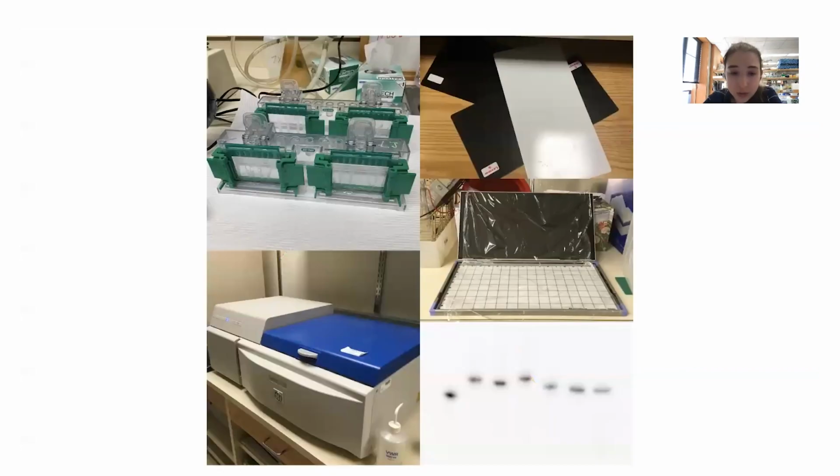And how we actually visualize it: in the olden days, it was done more with X-ray film type of stuff. Nowadays, we often use these phosphor storage screens. Basically these screens have a molecule in them that's able to absorb the radioactive signal given off by the probe and store it.